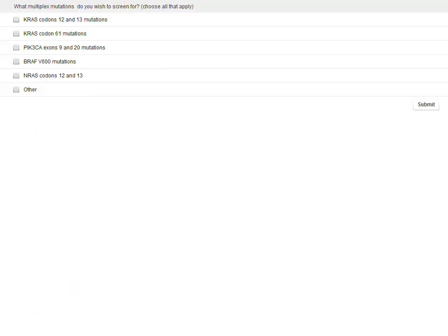Chance, the last poll question is for you. Thank you very much. So this once again is another poll question, which will be our final poll question. Again, you can pick multiple answers here, so please select all of those that apply to you and then press submit. So our question is, what multiplex mutations do you wish to screen for? Answers are KRAS codons 12 and 13, KRAS codon 61 mutations, PIK3CA exons 9 and 20 mutations, BRAF V600 mutations, NRAS codons 12 and 13, or finally other.